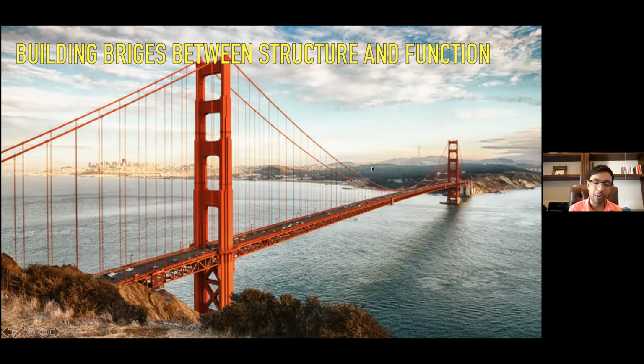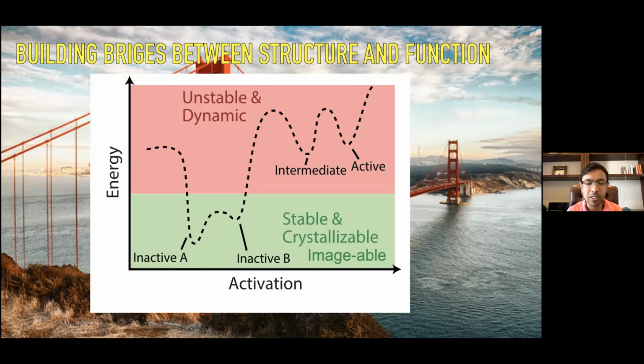Okay, so if we think about this now from the perspective of structural biology, while cryo-EM is an incredibly enabling technique, it is still limited by the fact that our view of structural biology is limited to low energy states of signaling systems. These are usually the stable states that are either crystallizable or imageable. They're the ones that average together and that we can see in large numbers when we do a cryo-EM experiment.